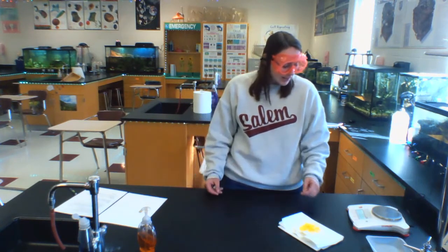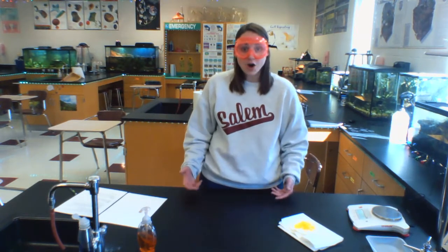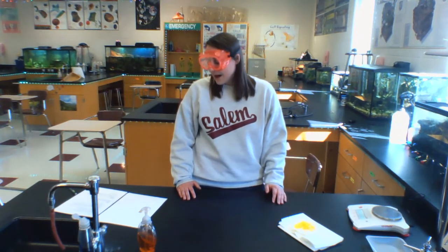Now, something that I kind of messed up on yesterday was that I forgot to tell you that before the video started, I had found the mass of my filter paper. The reason is that today, when I find the mass of the filter paper with the product on it, I want to just be able to subtract out the mass of the filter paper to get the overall mass of the product. So yesterday, before the video started, I found the mass of my filter paper when it was dry, and that mass was 0.90 grams.